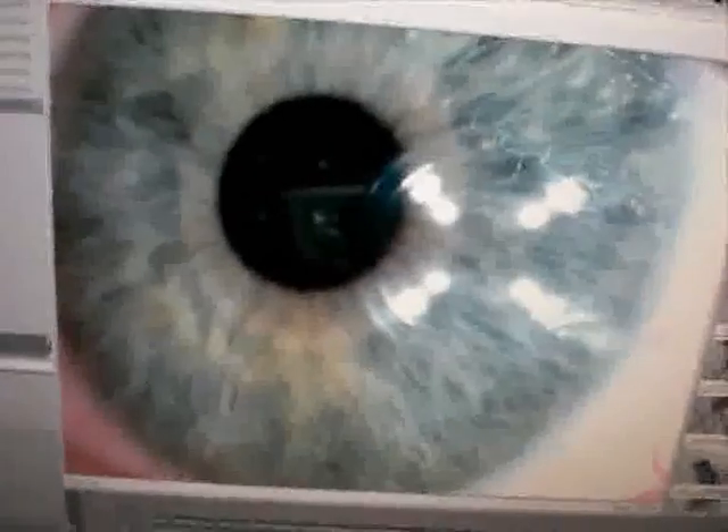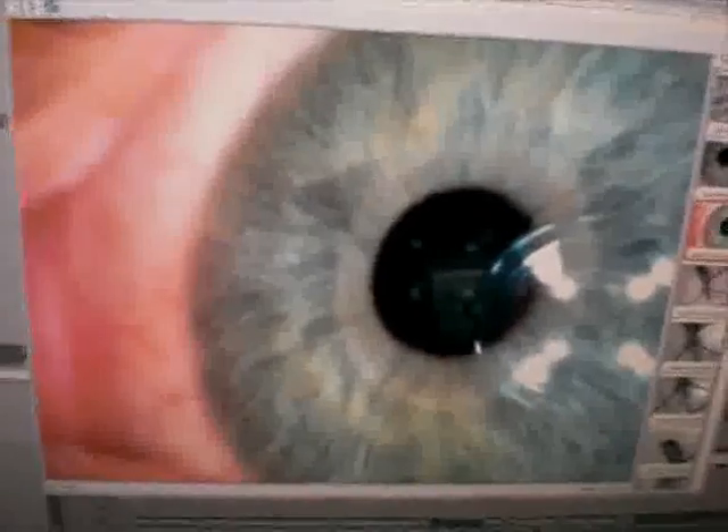That's kind of interesting. But I actually have one here — you can take photographs as well. So here's my eye. Maybe that one's a bit better.